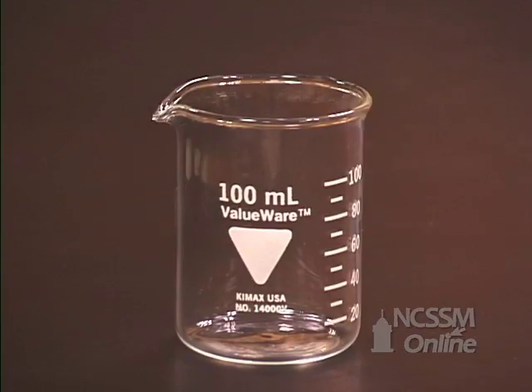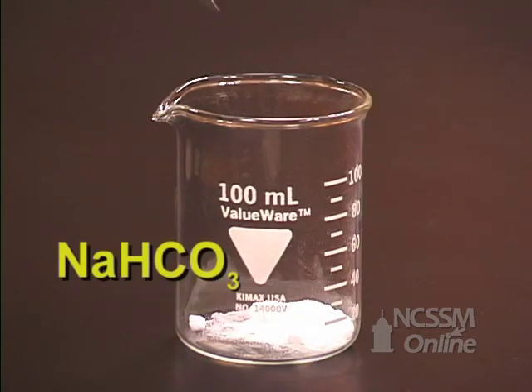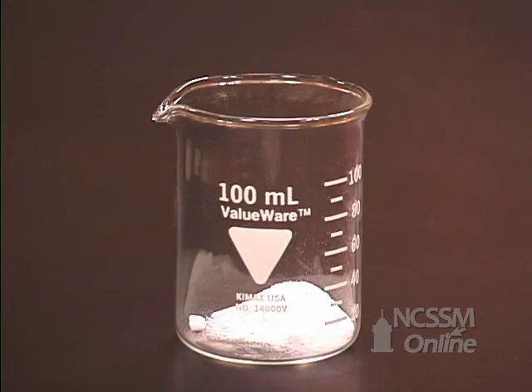In the reaction of sodium hydrogen carbonate with hydrochloric acid, you will mass a 100 milliliter beaker. You will then add about 2 grams of sodium hydrogen carbonate to the beaker. You will remass the beaker and the sodium hydrogen carbonate to give you the mass of the sodium hydrogen carbonate.